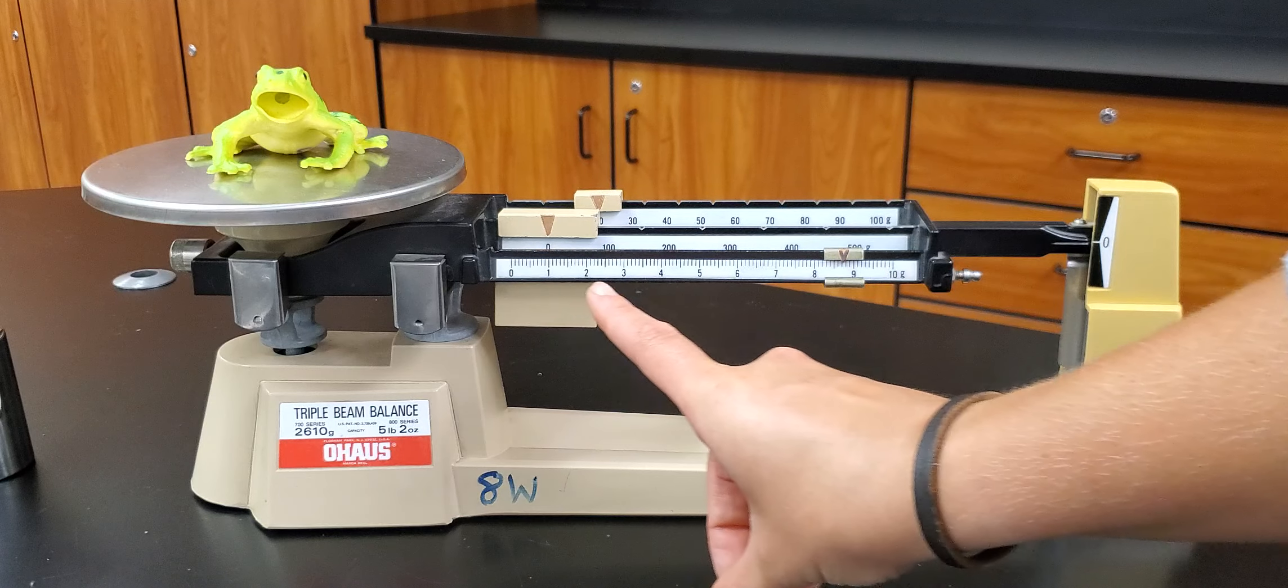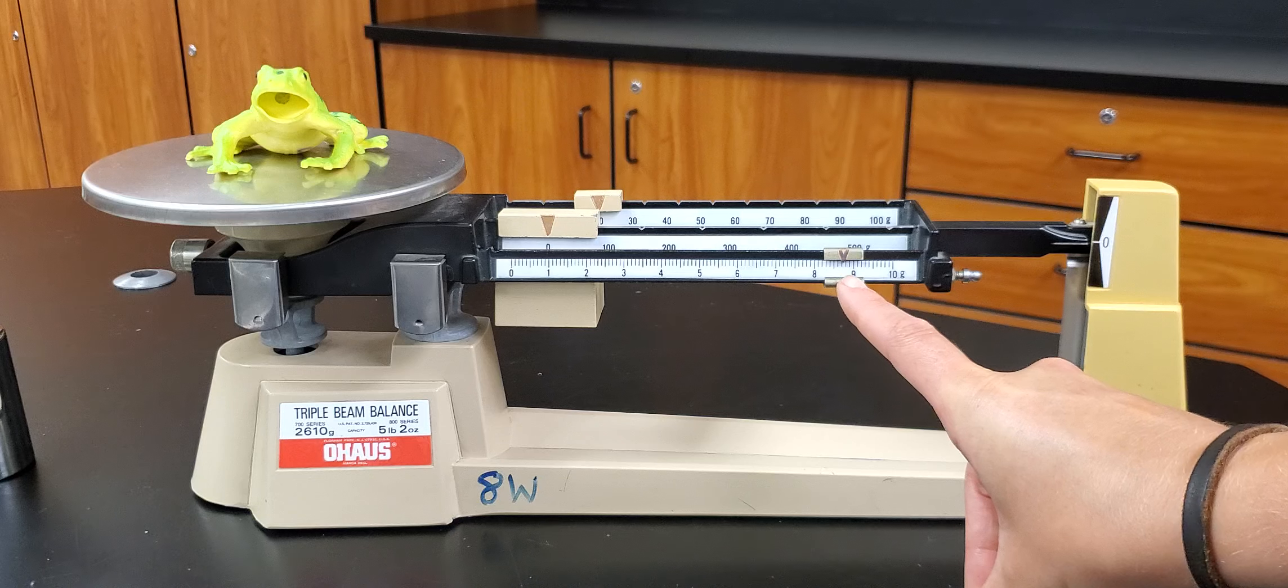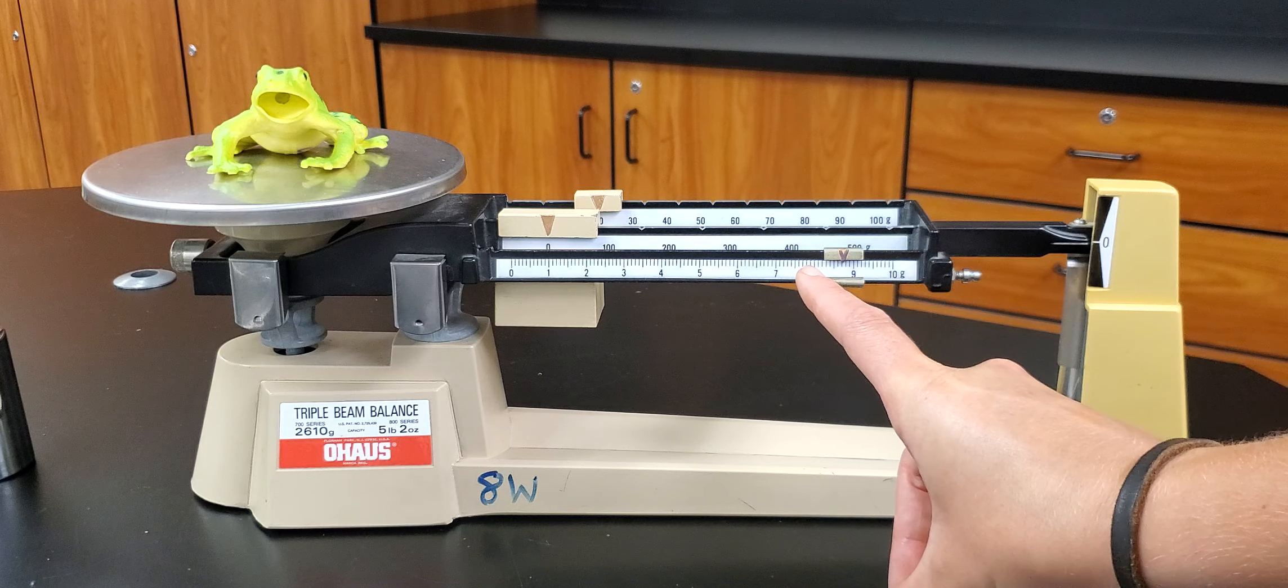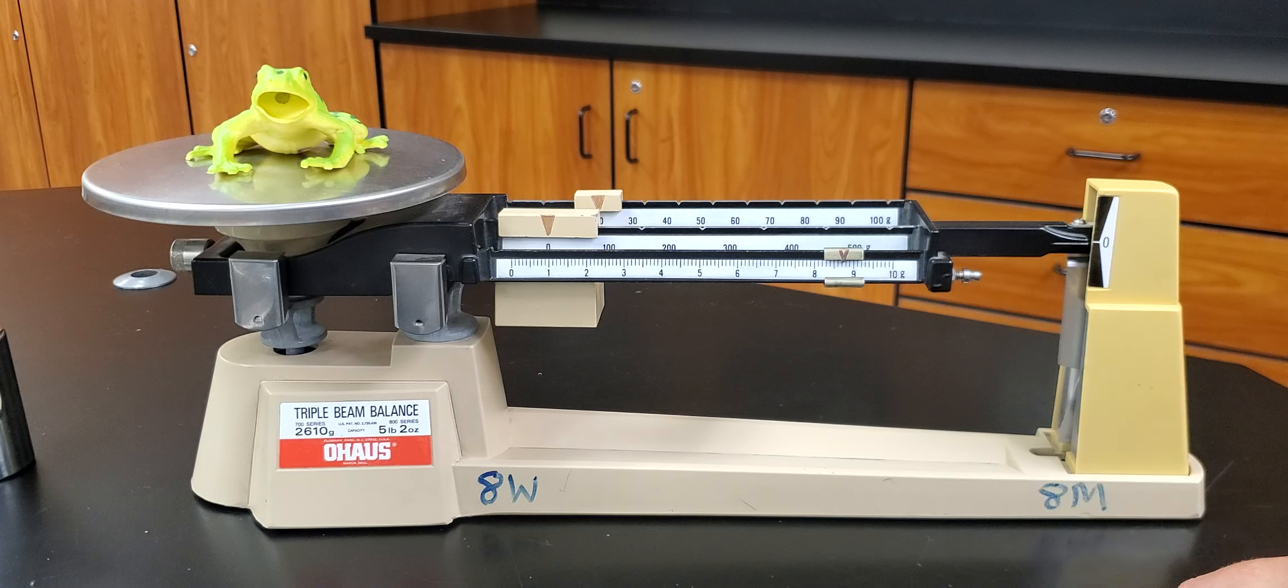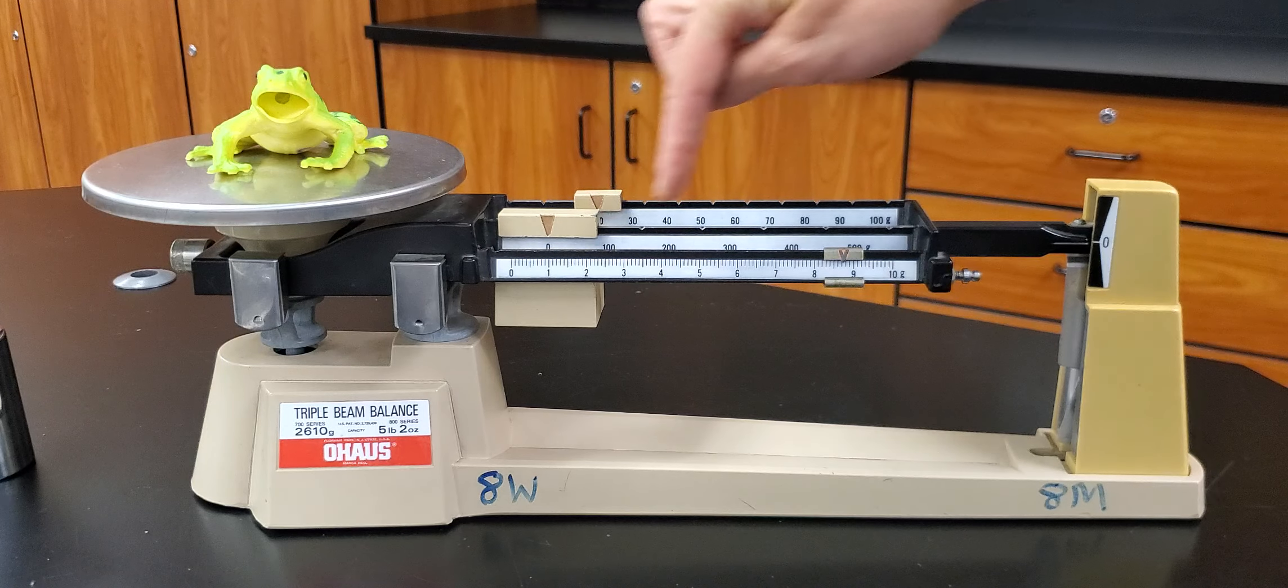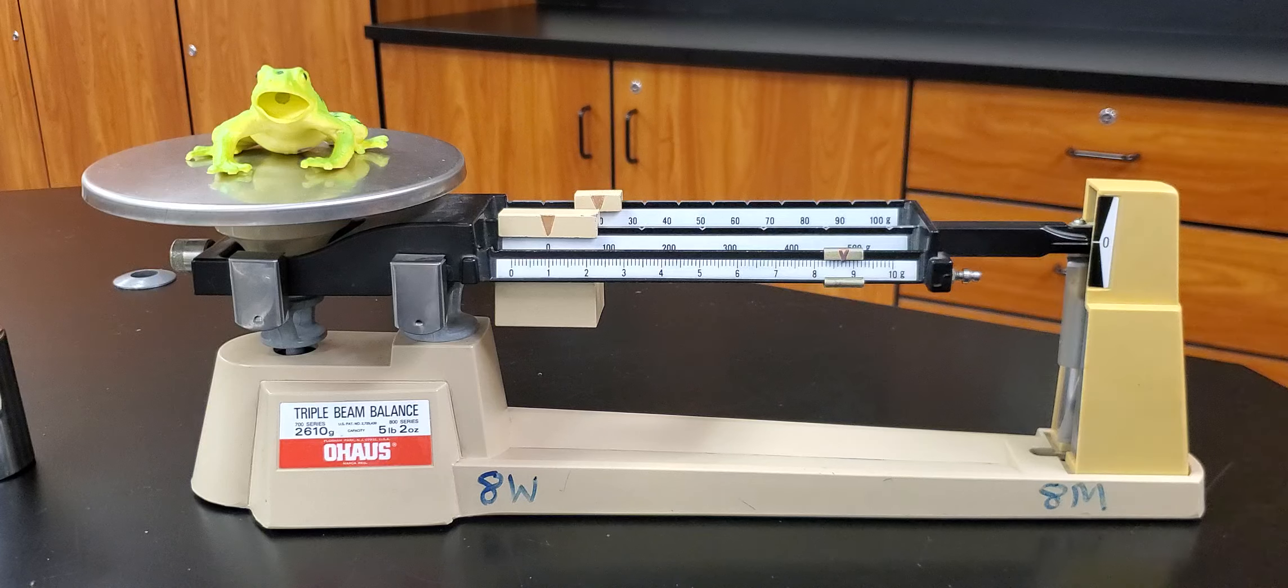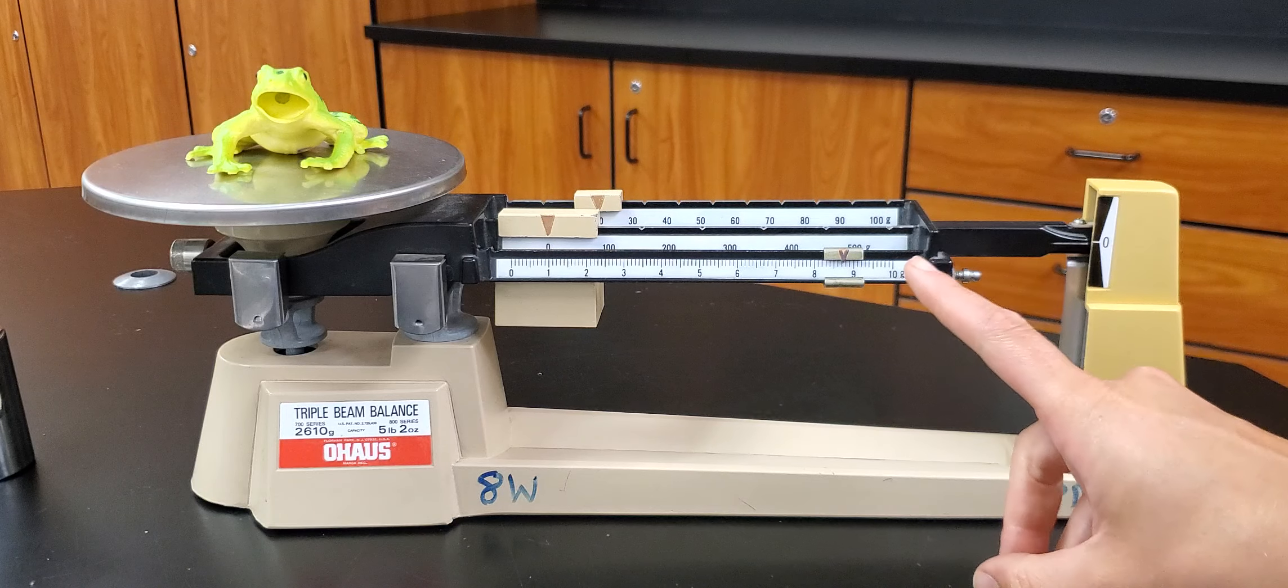So now we need to look at the ones place and we see that it's measuring about eight point I think seven. I think there's seven tick marks after that eight. So that means in the tens place I have twenty. In the ones place I have eight point seven. So the final mass of my frog is twenty eight point seven grams.